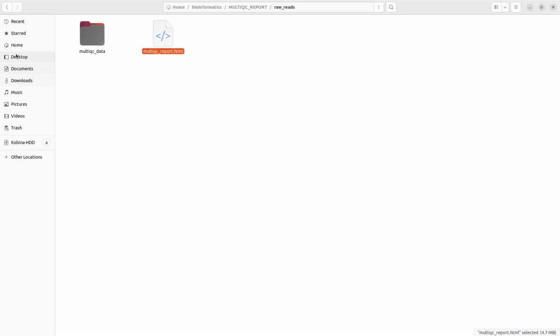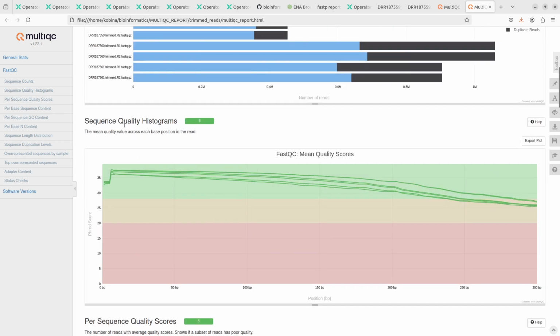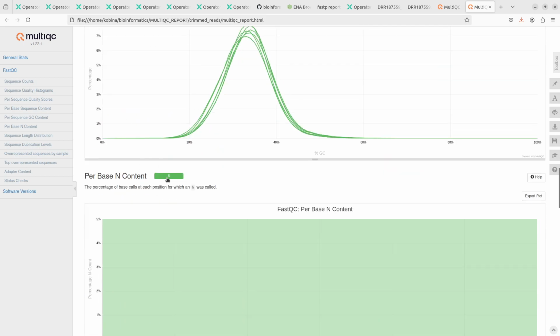If you also want to check the trimmed ones, we see that also here. We can see that, and you can also check their names. It uses the names of the files themselves. We see that also here. So this is so cool. This is the power of Nextflow, all right? And you can just check them out later.